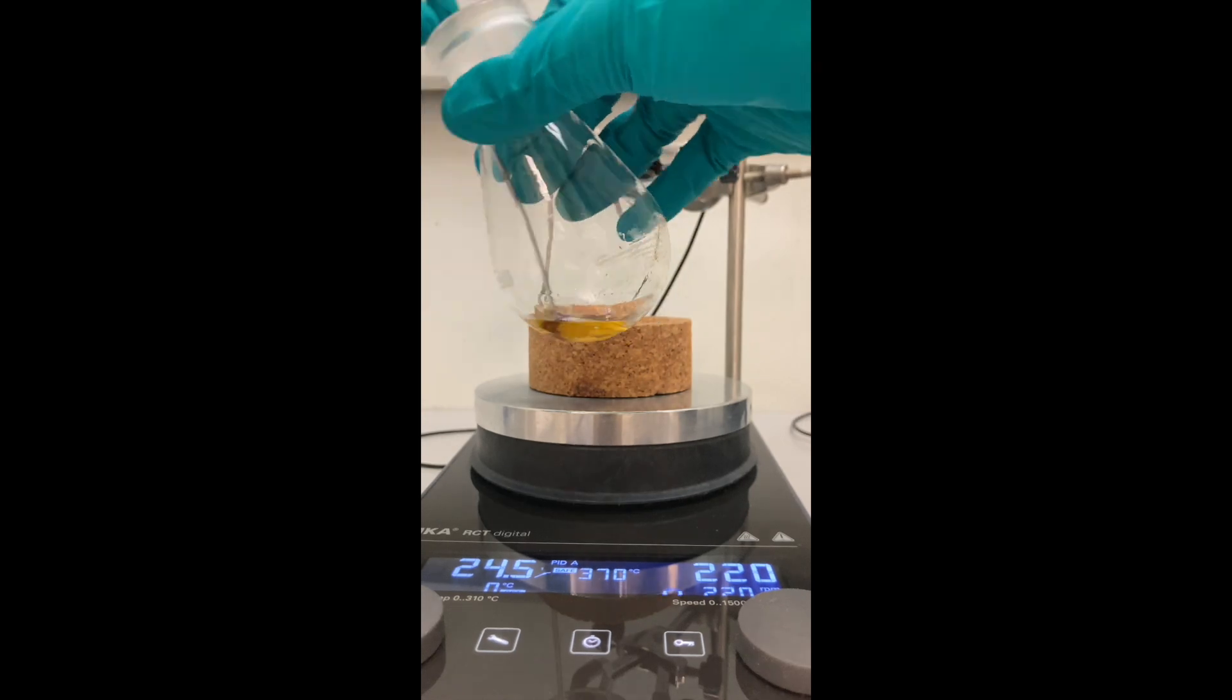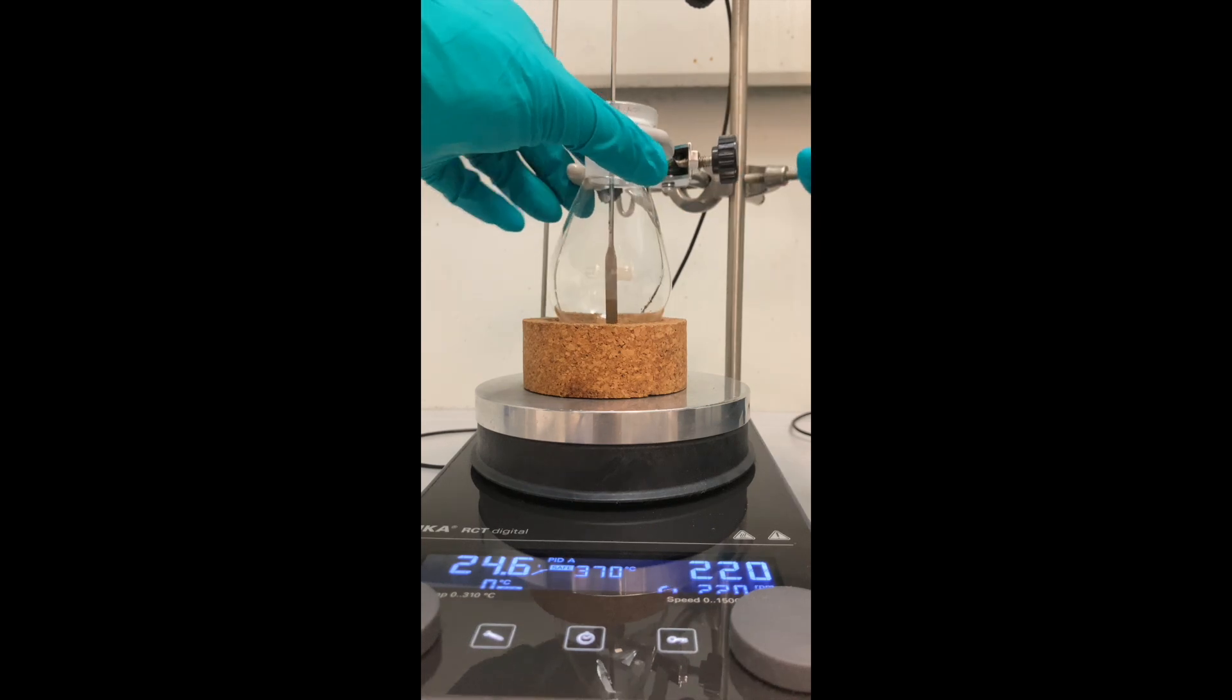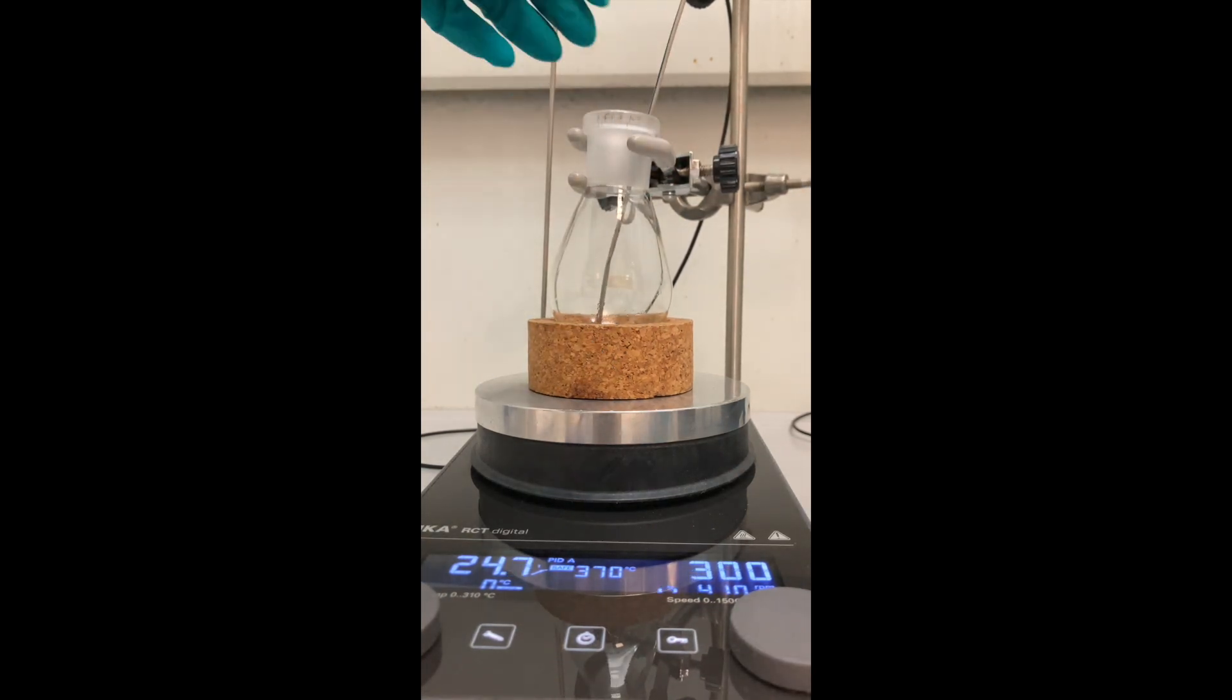First, I added the aldehyde and the amine into a round-bottom flask. Then, I poured in some acetic acid in order to dissolve the solids.